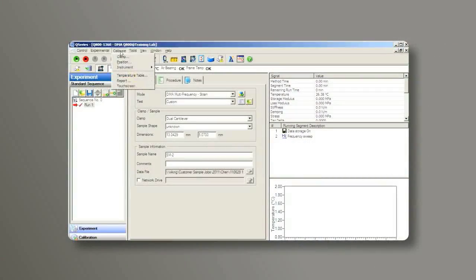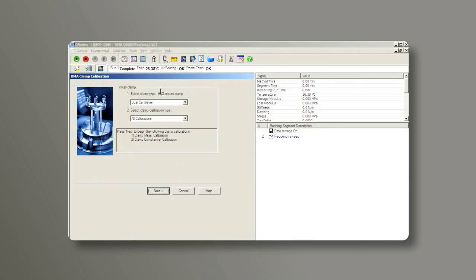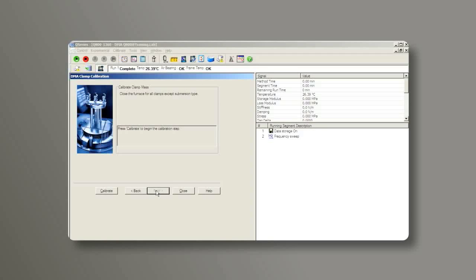From the control software, go to Calibrate, Clamp. Choose Dual Cantilever, All Calibrations, then Next. Close the furnace from the instrument touch screen, then click on Calibrate.